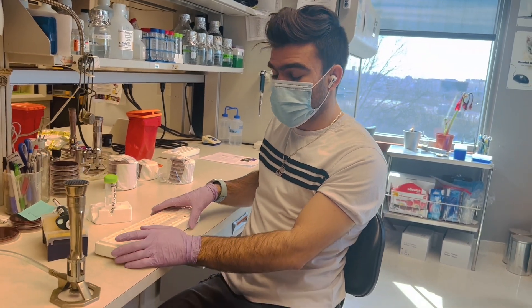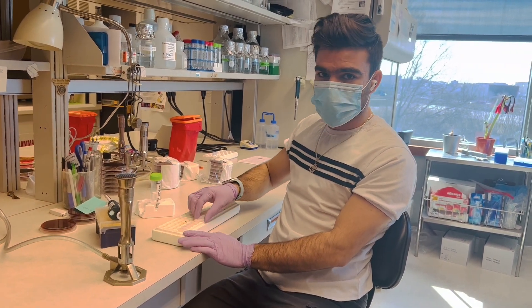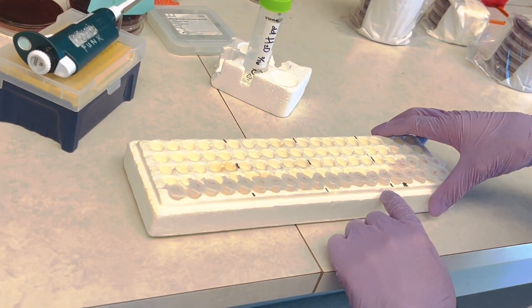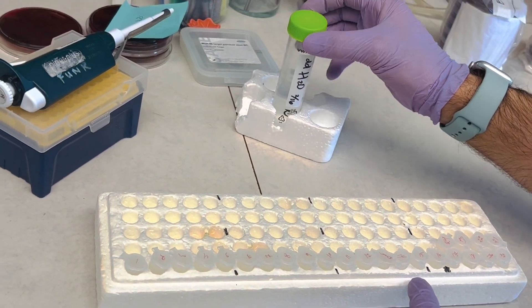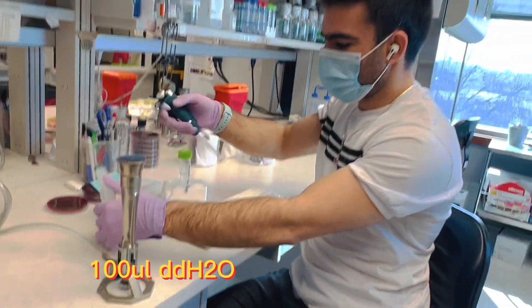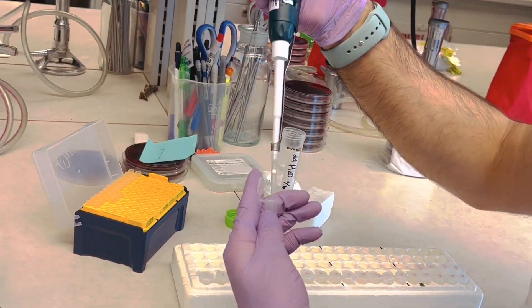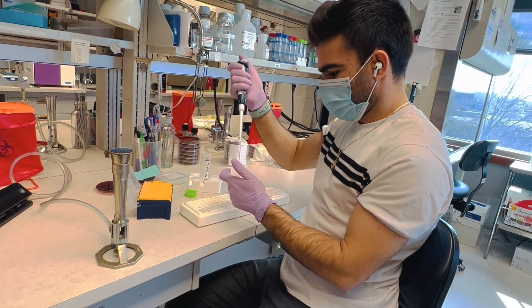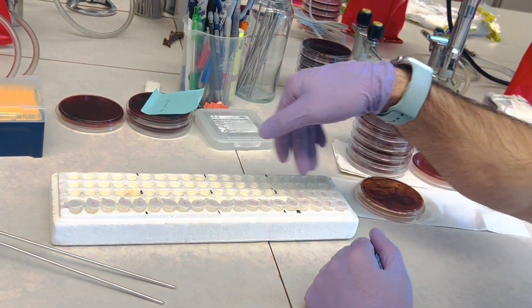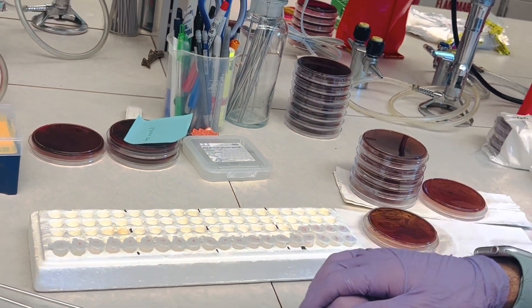The first step is to prepare the boil lysate. For that, first you need to take culture tubes and label them with the isolate number. Then add 100 microliters of double distilled water to each tube. I've added 100 microliters of double distilled water in each of these culture tubes labeled with the corresponding isolates.